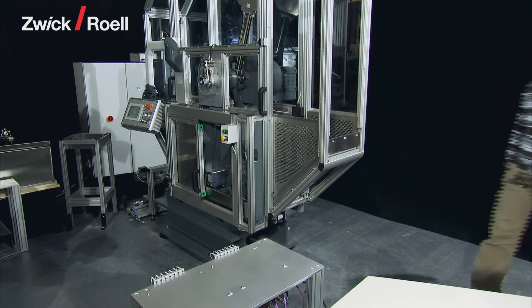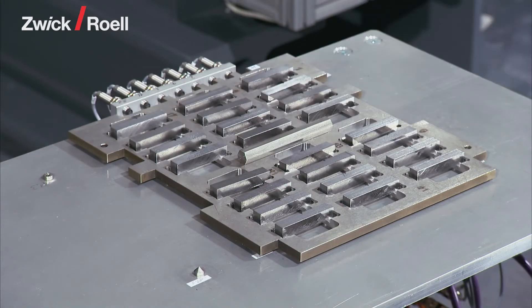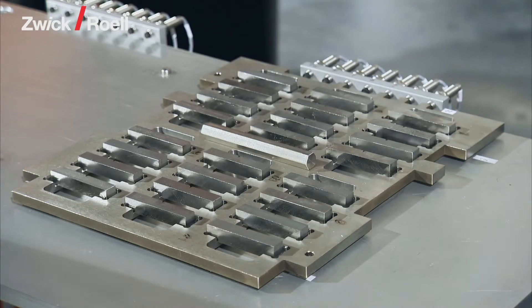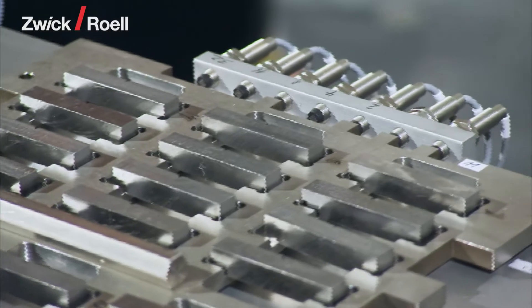The filled carrier moves on a conveyor belt to the unit, here simulated by manual setting on. The unit is started with the button on the operator panel. As soon as a magazine arrives at the transfer position, it is identified by a code and the appropriate data is assigned.